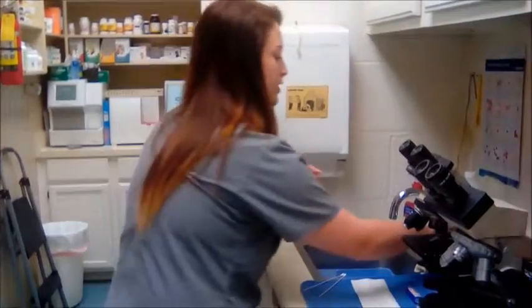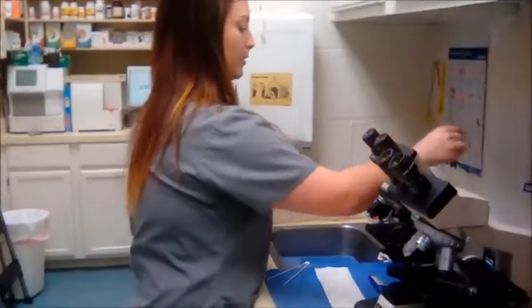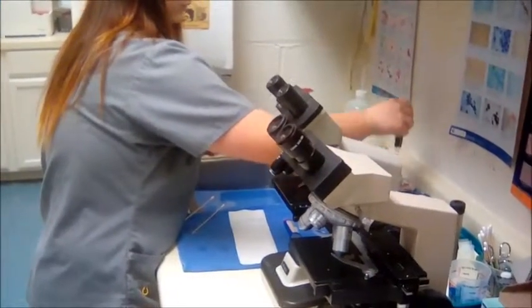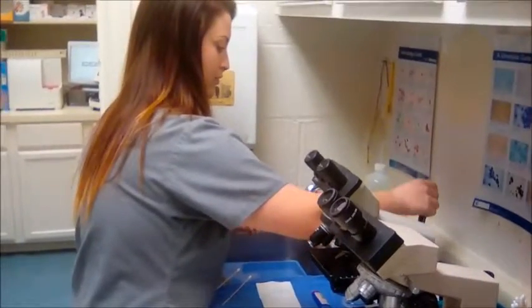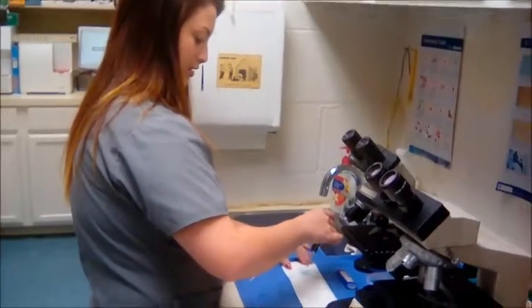Okay, I'm going to take my clip and I've got my stain and I'm going to dip it into each stain ten times. Now I'm just going to tap that excess stain off before I dip it into the next one.